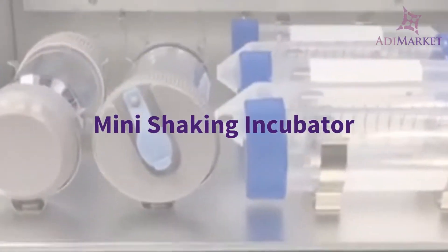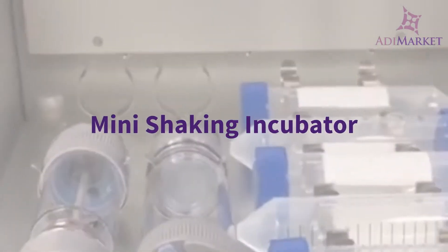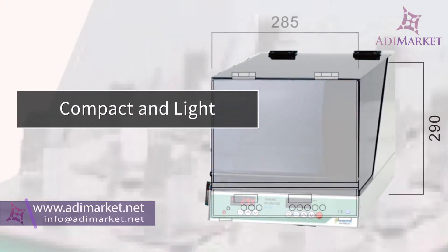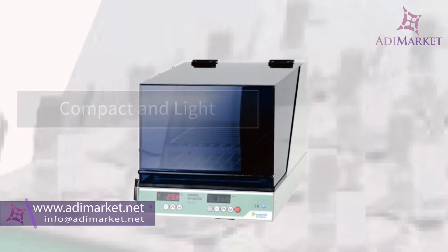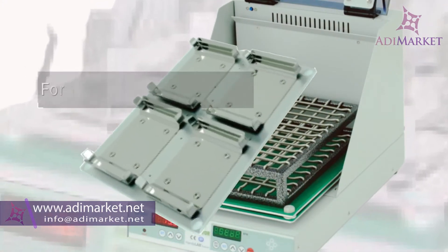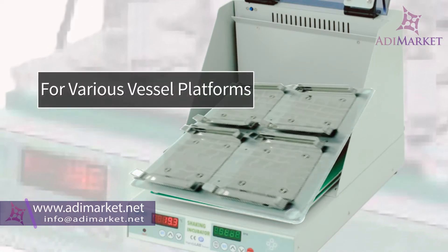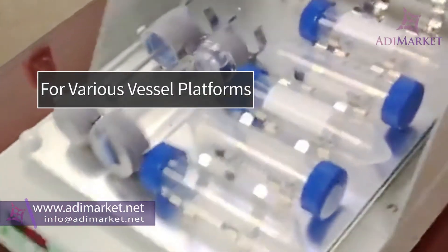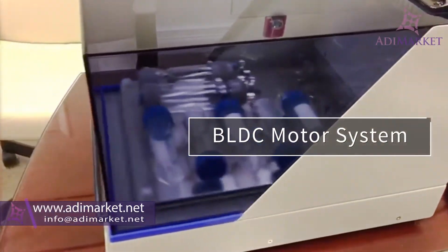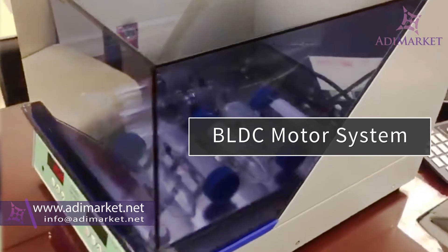Having a shaking incubator in the office can make your work more efficient and can also save you money. The mini shaker is the most compact shaking incubator in its class. Even though this machine is compact, you'll get a large working space that accepts a variety of tubes, flasks, and syringes.